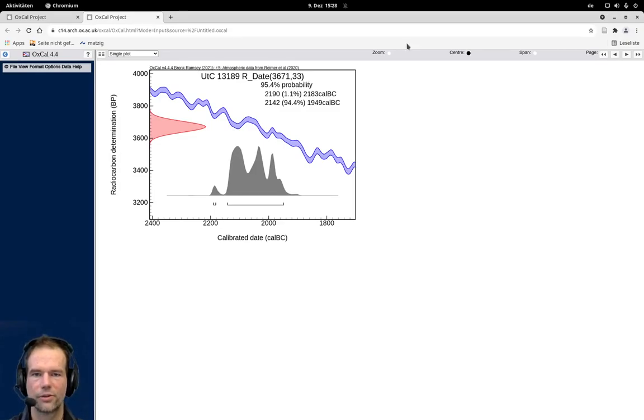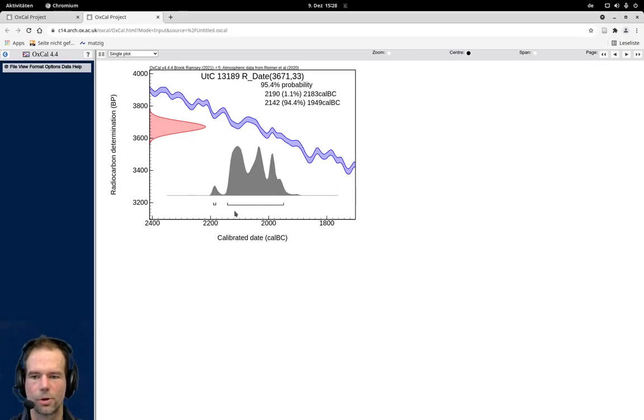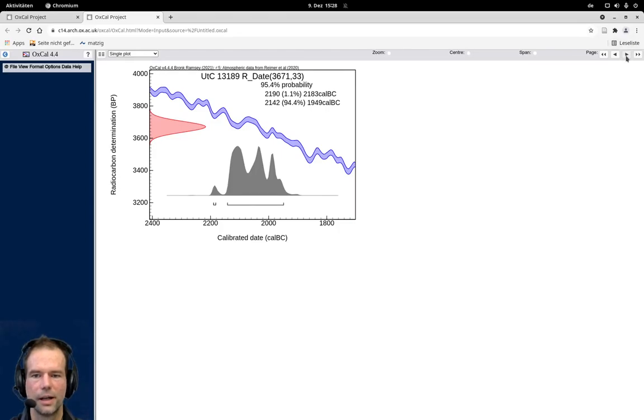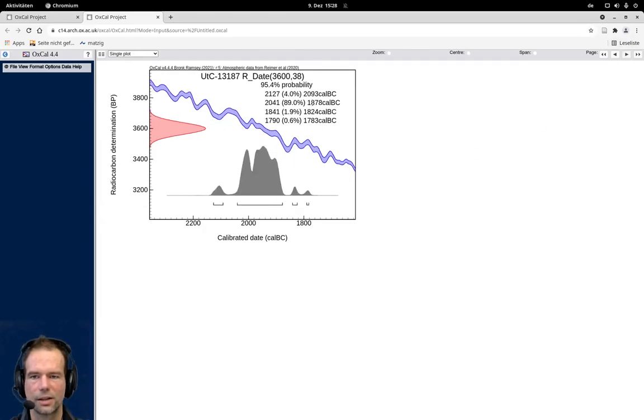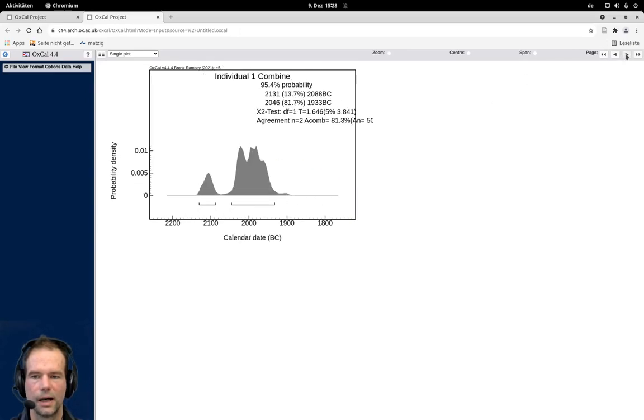Let's run this model or this calibration. And we can see now here the first individual date. We have seen that before with quite a spread of 200 or nearly 300 years. And the second date here with also a spread of actually more than 300 years.